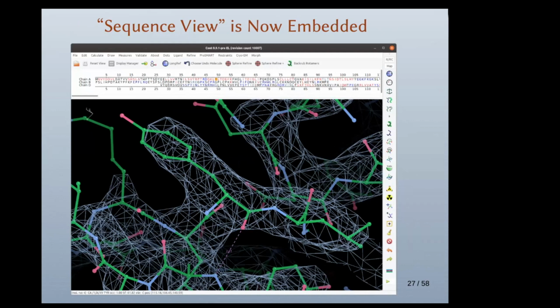So having thought about that, reflecting on it, I am now changing the program to act in a way that's expected, rather than in a way that I thought was a good idea in 2004. So one of those ways is to bring all of the functionality into one frame instead of multiple floating dialogues floating around the screen. Coot will bring its information into this panel, into this frame here.